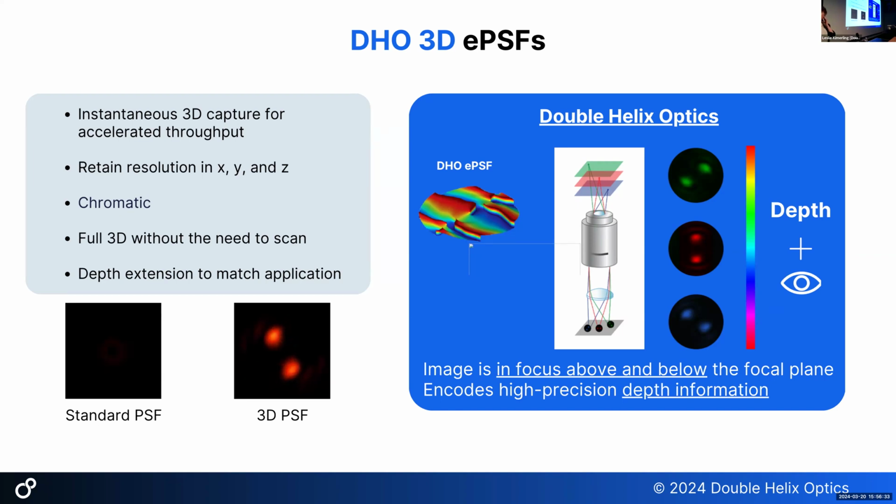So you have to crop your faceplate. No, you have to align it to, in this case, you're attaching it to a microscope, so you want it aligned with the objective. But mainly in a Z direction. Yeah. Along the optical axis.